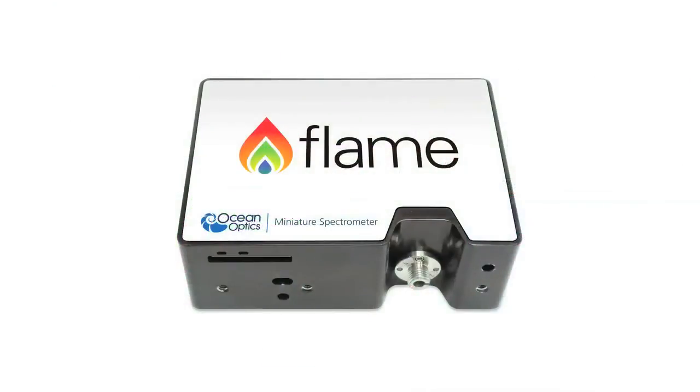The Flame S VIS NIR is a powerful spectrometer in the palm of your hand. Its high sensitivity allows you to capture low intensity signals.